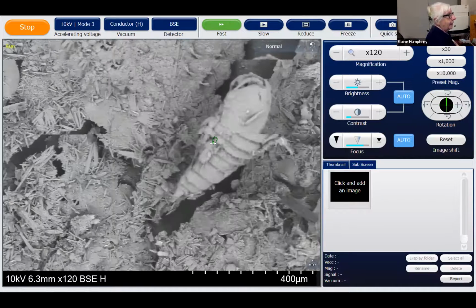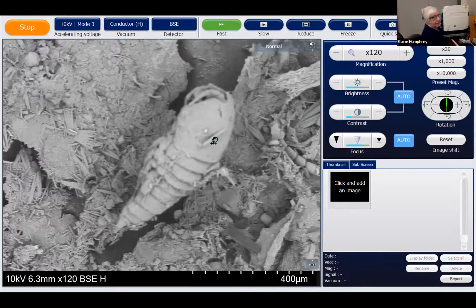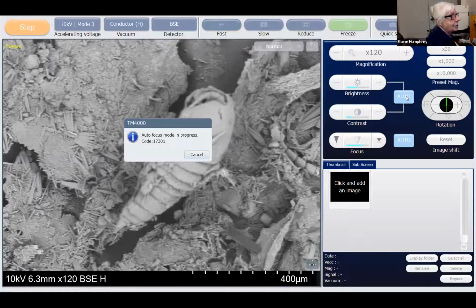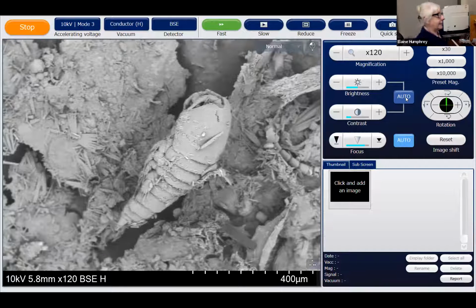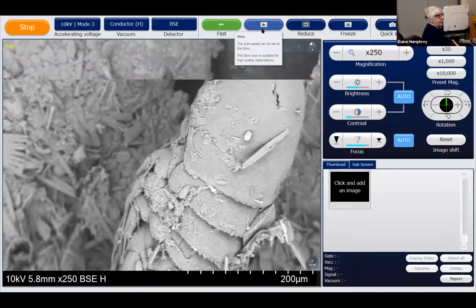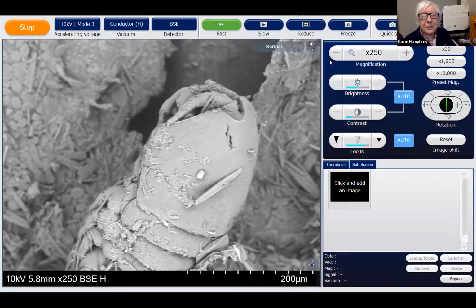So here's Bob. He was named Bob by one class of kids, and he's been Bob ever since. But Bob is a copepod, and we'll go autofocus, and he's got short antenna. So we expect him to feed on other zooplankton, right? And if we zoom in some more, what we say to the kids is, you have your squidgy bits on the outside and your hard bits on the inside. But a copepod has his squidgy bits on the inside and his hard bits on the outside.